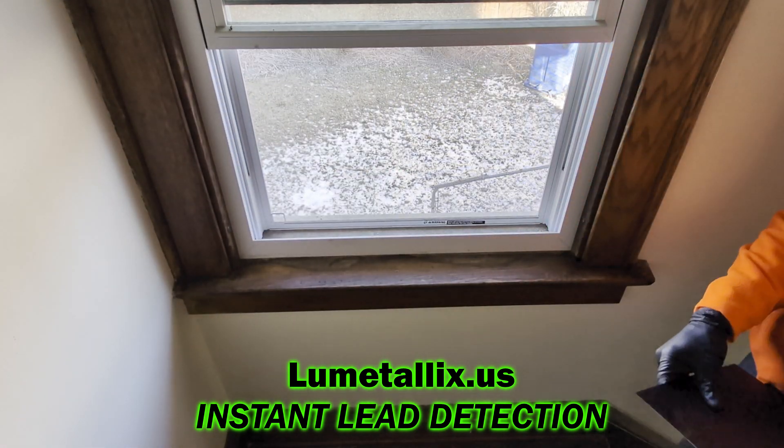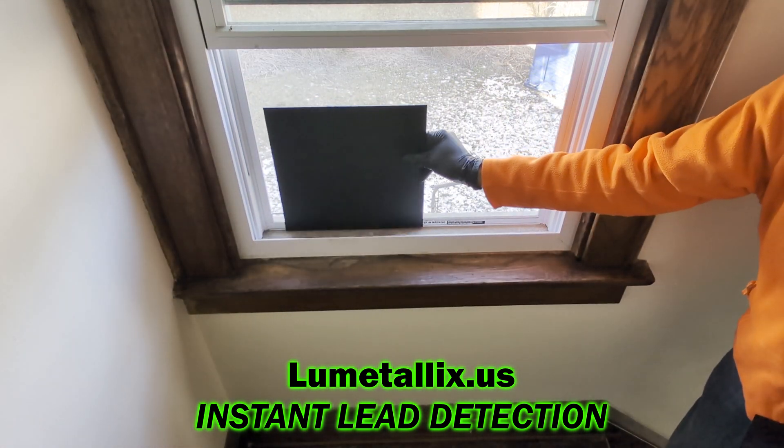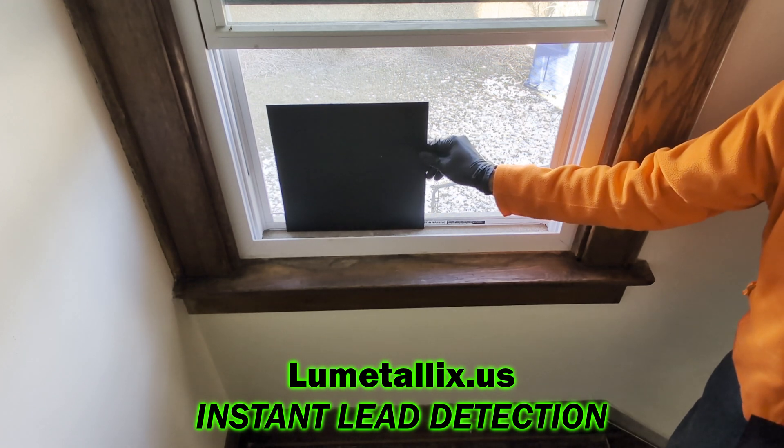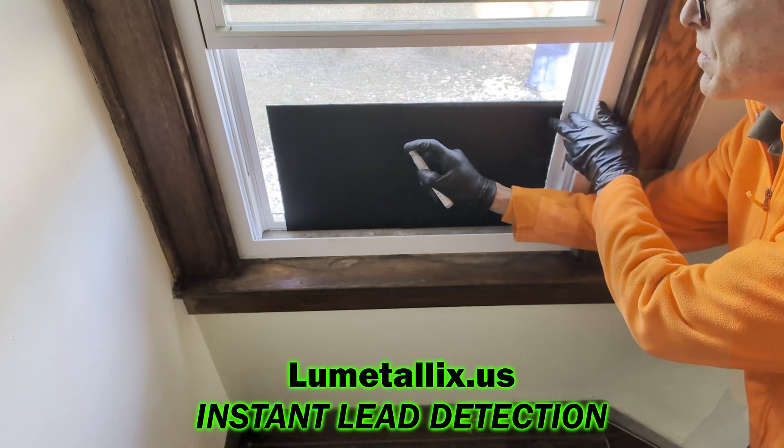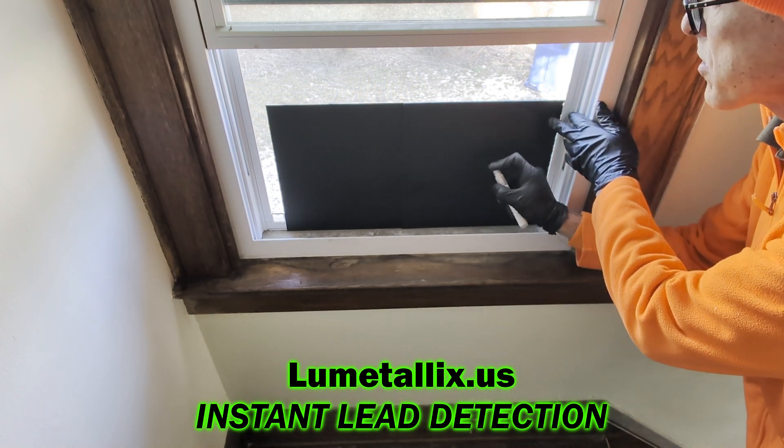To start using Lumetallix Instant Lead Detection Kit, I use two black plastic sheets to shade the area I'm going to test. Lumetallix works best in low light conditions.